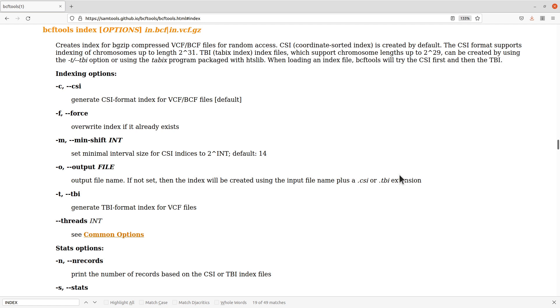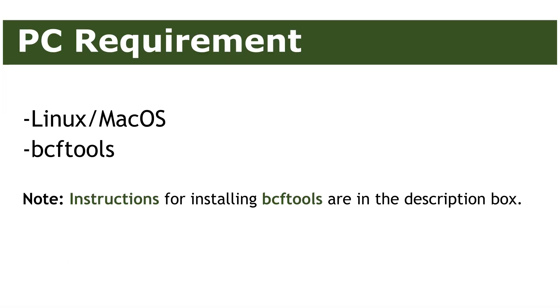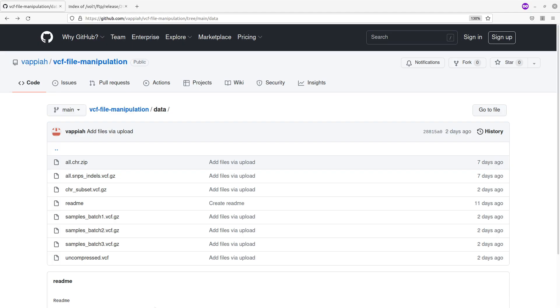For this tutorial, you need to make sure that you have bcftools installed on your PC. That is what we are going to use. For datasets, we have the publicly available one that we are going to use. Let's proceed.